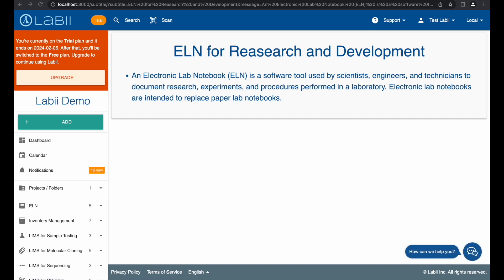Welcome to Labii Tutorial. Labii is the next-generation research platform that seamlessly integrates electronic lab notebook and laboratory information management system, with high customization and widget extendability for a variety of disciplines.